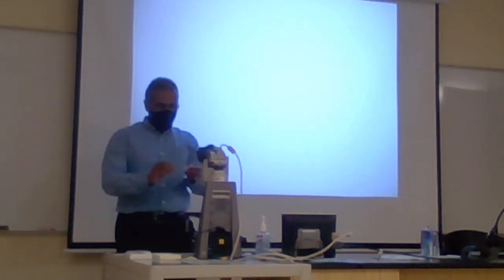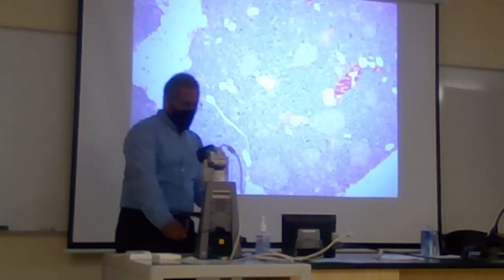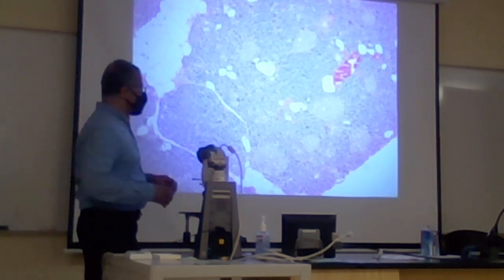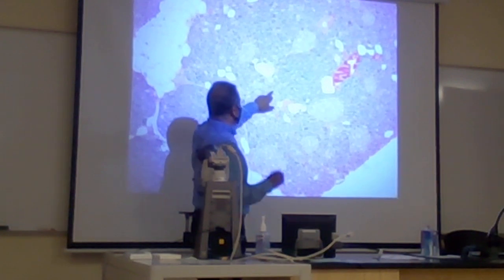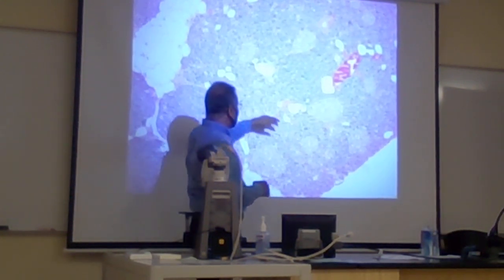The next one we're going to look at is the pancreas. We already know from the discussion on the digestive system that the pancreas is packed with pancreatic acinar cells, right? Acini. You see all of these darker oval or circular shapes with a little lumen inside; those are all acini.